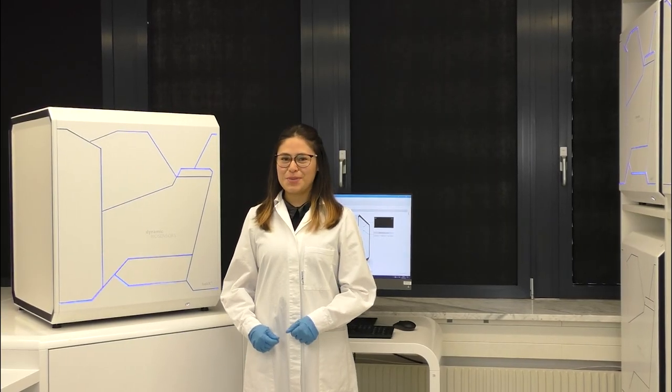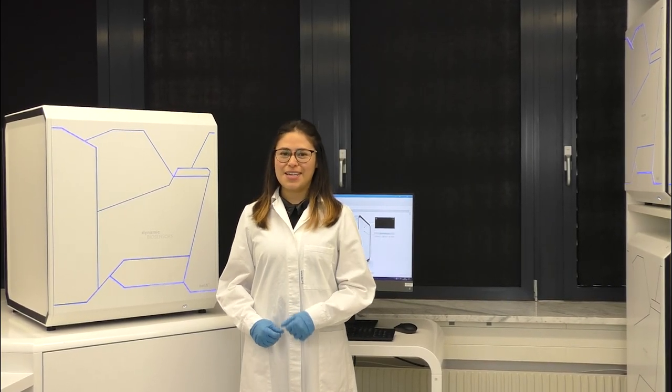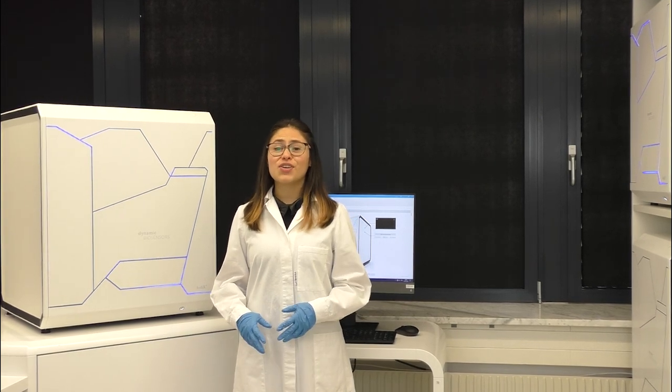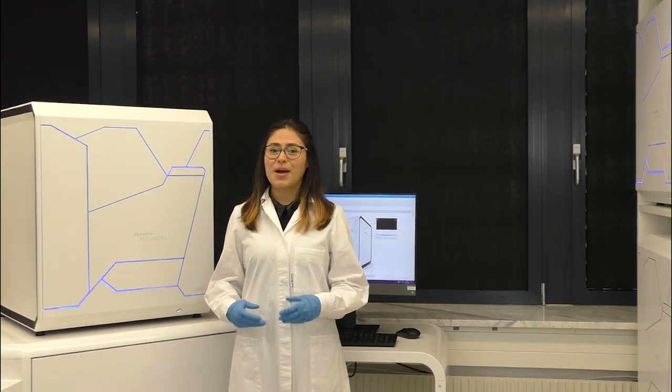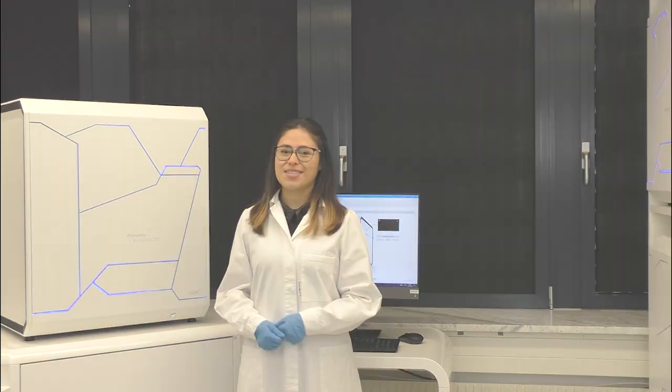Hi, I'm Anai Higuera and I'm an Application Specialist here at Dynamic Biosensors. In this tutorial, I would like to show you how binding kinetics can be measured using our new Helix Biosensor System.